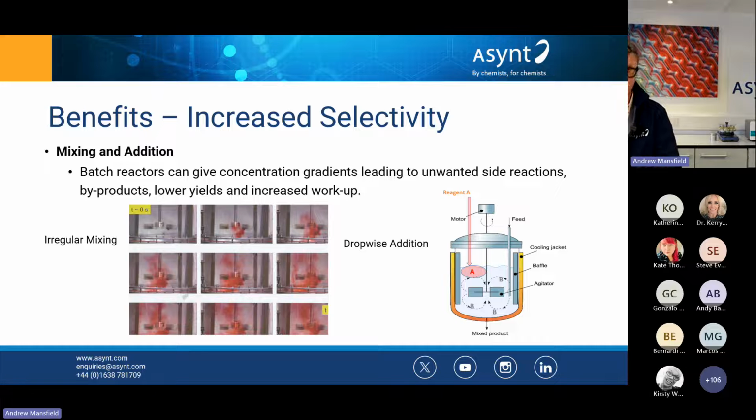from one reaction to the next. It's chaotic, it's turbulent mixing. Now I've taken the timestamps off of this image because that can be quite quick, but some reactions are very quick, and you need precise, very efficient mass transfer to get the optimum conditions from our reaction.